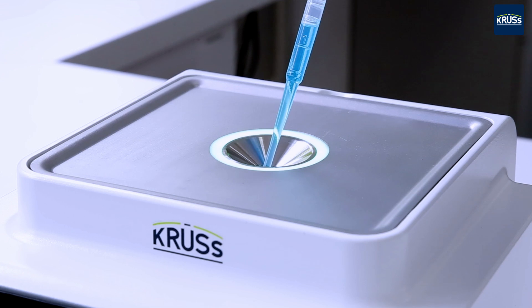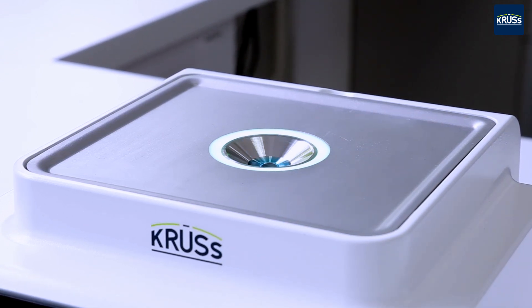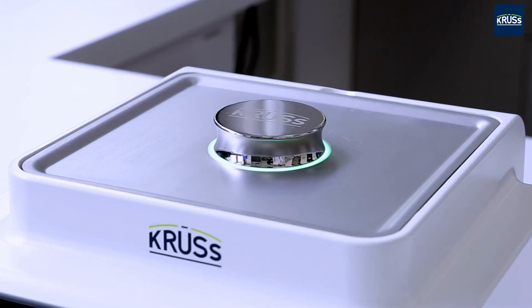Filling and cleaning is particularly easy thanks to a flat measuring tray made of stainless steel. The SAFIRE measuring prism is scratch and chemical resistant.